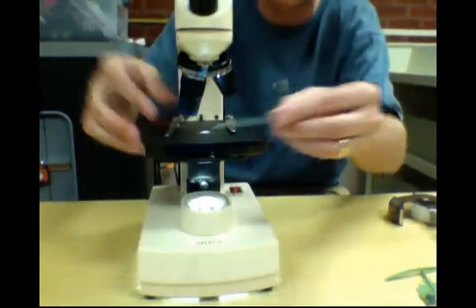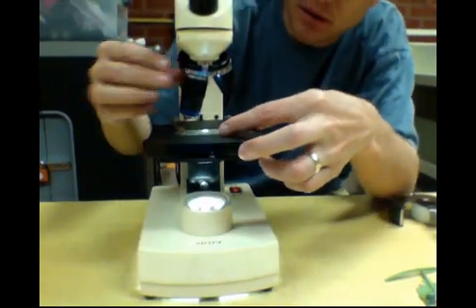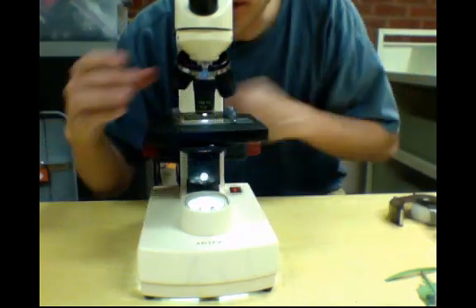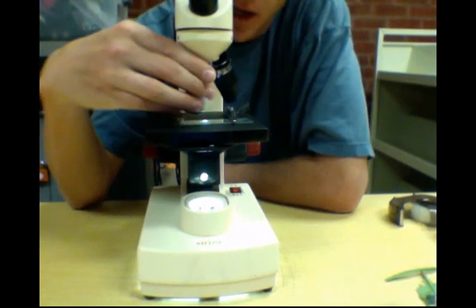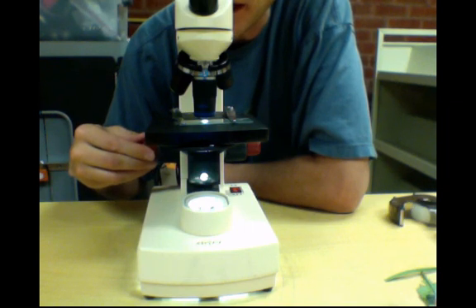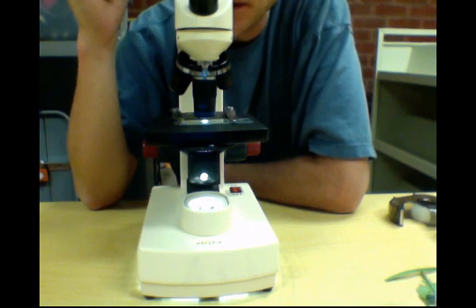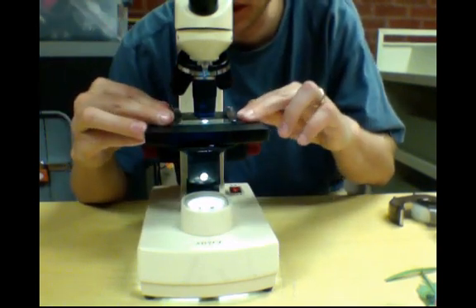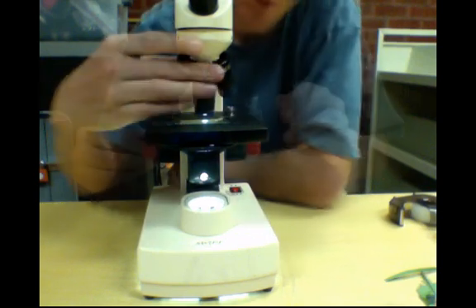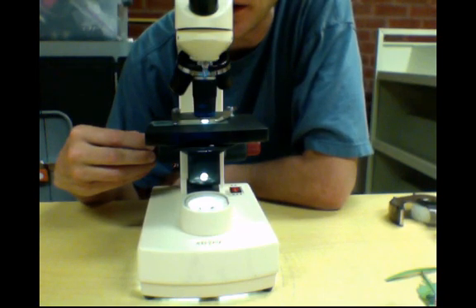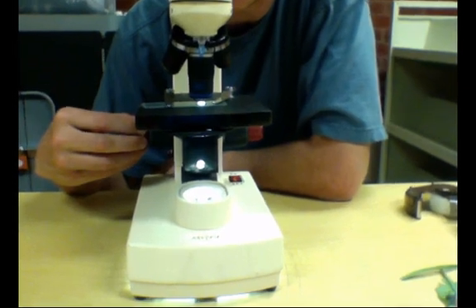I'm going to take a look at this. All right. So I can see the cells, the epidermal cells. And now as I zoom in even closer I can start to see individual stomata. They're going to be spaced kind of randomly in a dicot. And then if I move over to the monocot. In a monocot, since all of the veins go in the same direction, the stomata are just lined up perfectly along that.